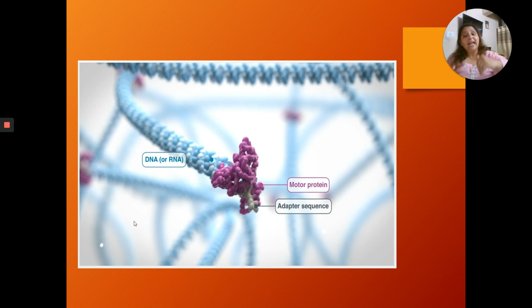Now the speed at which the DNA molecule is going inside, that must also be controlled. स्लो जाना है, फास्ट जाना है, मीडियम पेस में जाना है, that must also be controlled. मतलब उसको कहीं ना कहीं से तो पुश मिलना चाहिए ना. Think about कि मैं बैठी हूँ एक होल के सरफेस पे, कुएं के ऊपर बैठी हुई हूँ, but I have to jump into the well, but I would jump into the well only when there is some force.